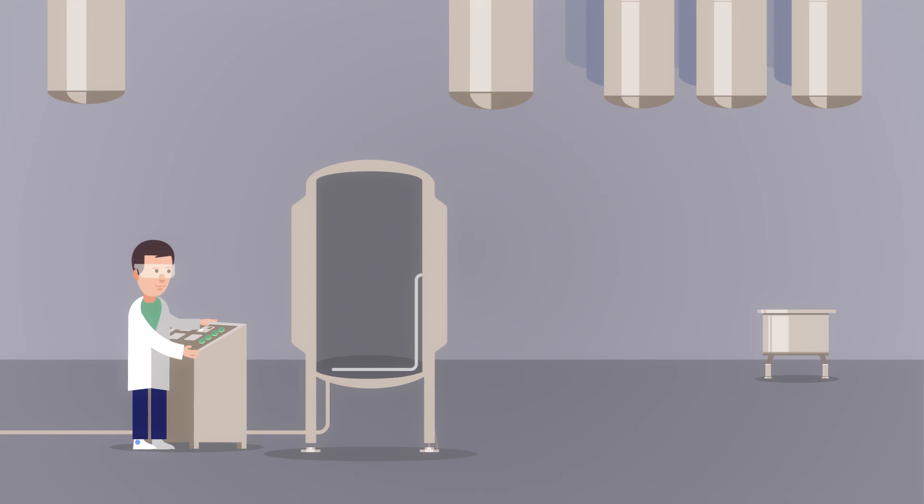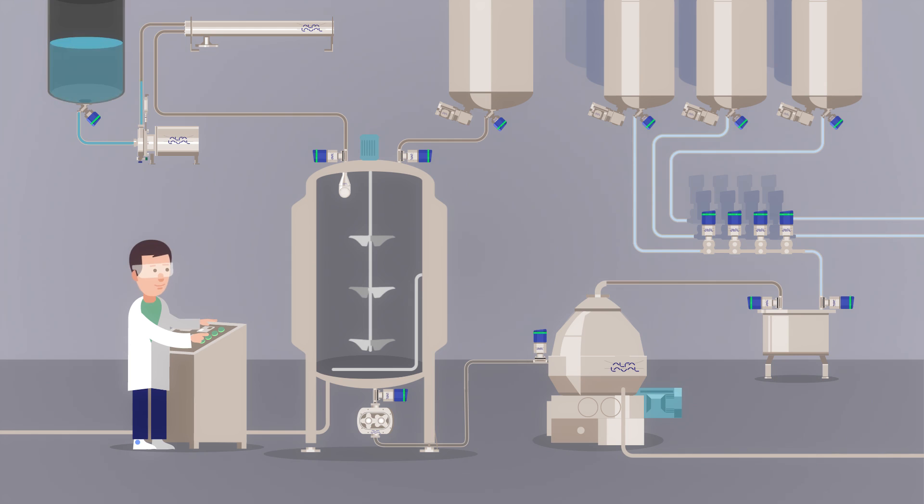Our innovative approach to fluid handling technology, including installation material, pumps, valves and tank equipment, reduces the risk of contamination, improves safety and reliability whilst delivering a higher yield and more uptime.